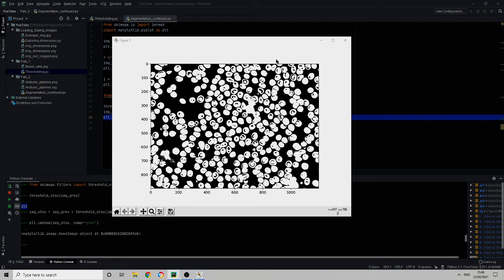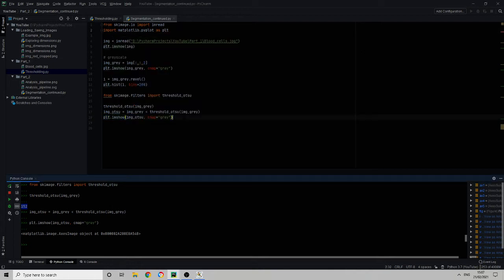So the first thing we can do is, when we have this donut shape, we can just fill it in. So we have the perimeter, and everything within the perimeter, we can just turn it to a 1. So then we remove the holes in our image, and that's very easily done. So that's what we're going to do first.